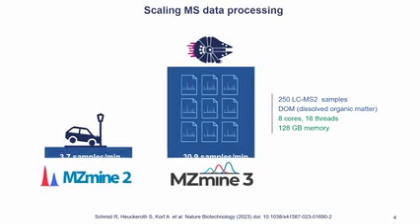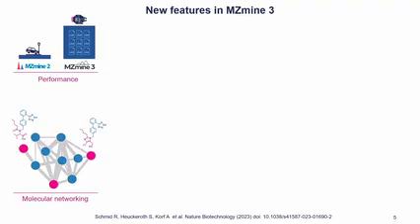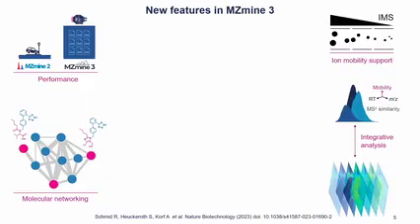Now that's not the only thing that's new in MZmine 3. Besides the performance improvements, we have had a lot of development in the molecular networking workflows, which are done in collaboration with Pieter Dorrestein's lab with the GNPS platform. But that I'm not going to talk about much today because it's not really related to ion mobility.